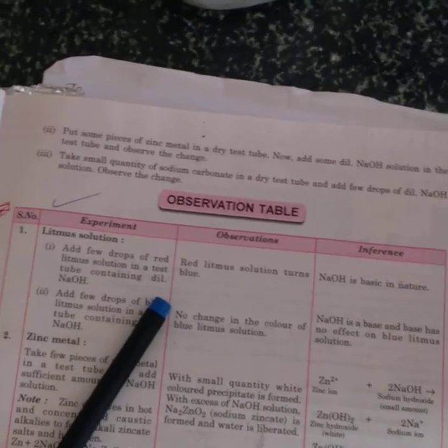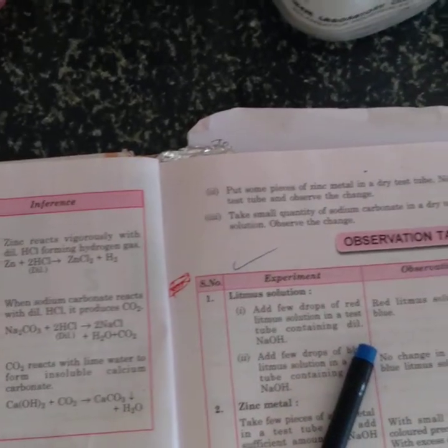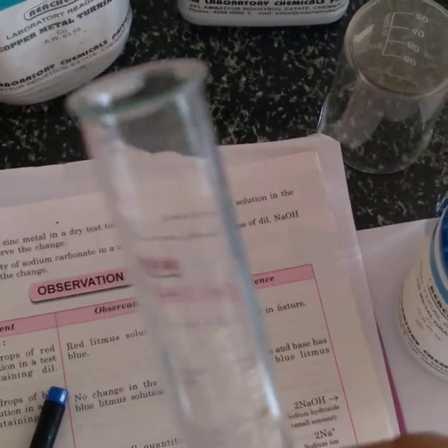I already taught you this in the practical also, and in the theory part I told about this sodium carbonate test. Let us perform the sodium carbonate test. Okay, so this is a test tube, a dry test tube.